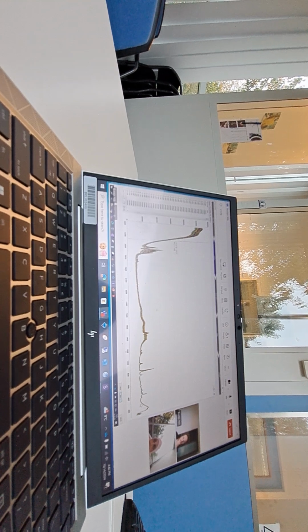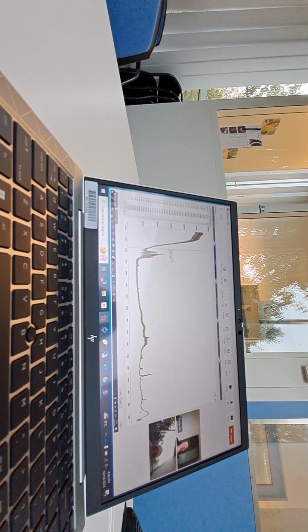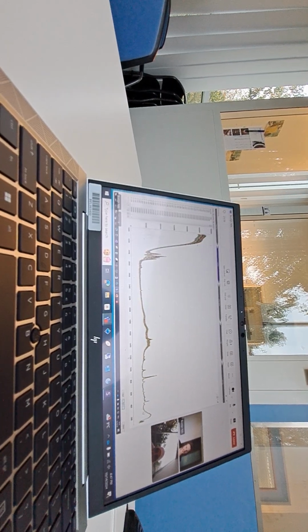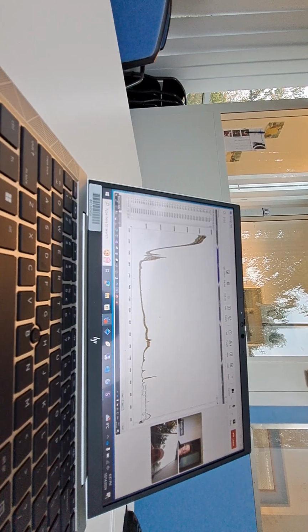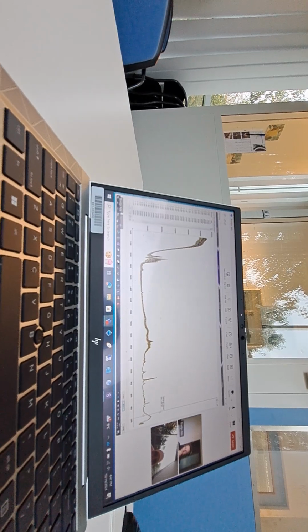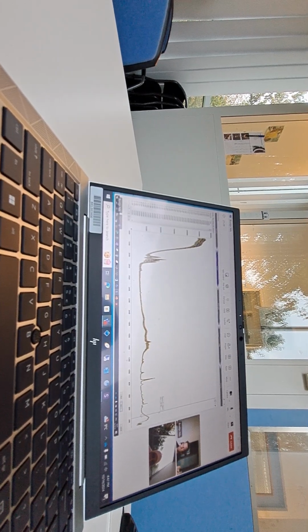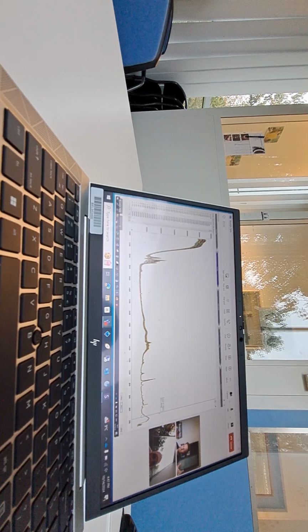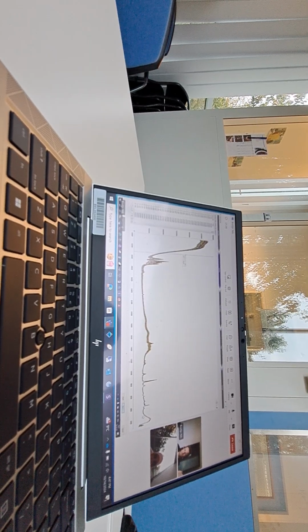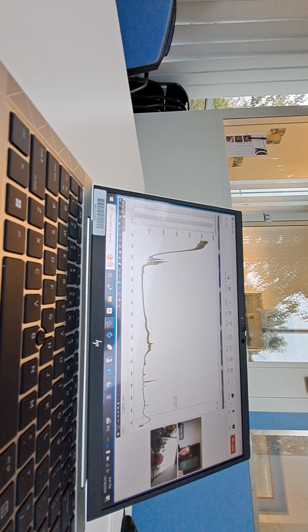As I said, here you can select the region. Most of the time it's good to remove part where you have like here, there's no information in here. This is just artifact. Same here. It's always good to remove these before you do the pre-processing, because you're doing certain calculations, and otherwise it takes these bad areas into the calculation, so it could ruin your spectra. So it's always good to remove those parts without information.